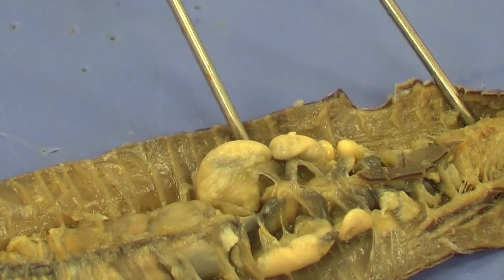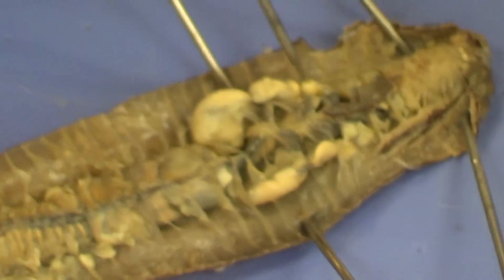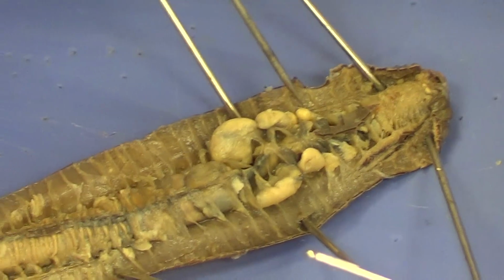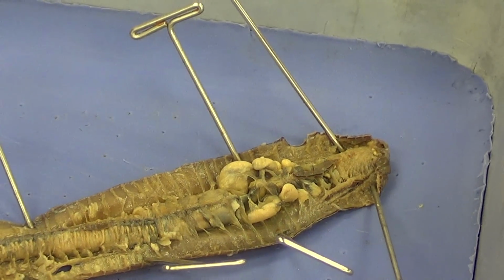Anterior to the seminal vesicles are some smaller structures. You can see it right here, and you can see one right there. And on the other side, they are not as good, maybe down in here a little bit. Those are going to be our seminal receptacles. Those receive the sperm of another worm and store it temporarily until fertilization is ready to take place.